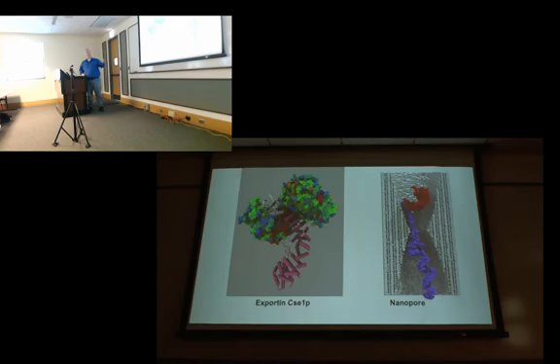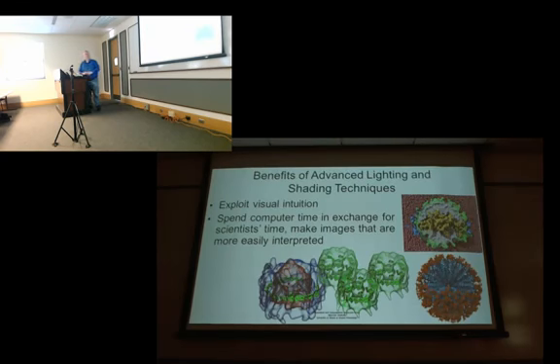And he was blown away, because when you just have the right lighting, you can immediately see that this pore has depth behind that structure. Without that shadowing, that makes all the difference in the understanding of the spatial relationships there. These are sort of easy examples I'm showing you, but that's the point of these techniques.